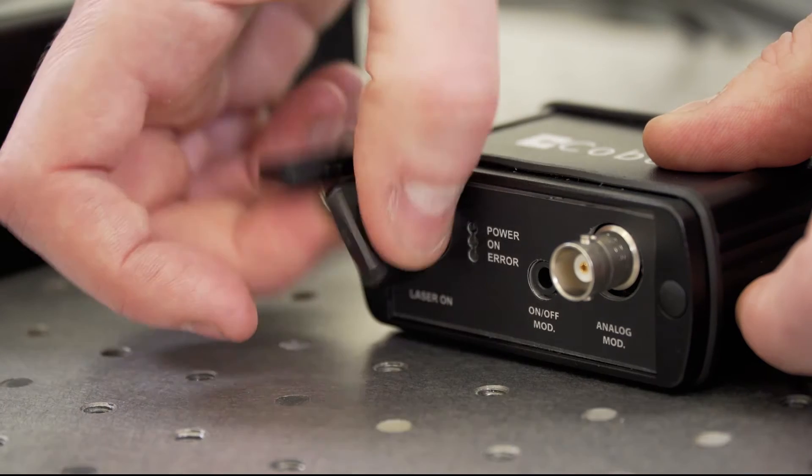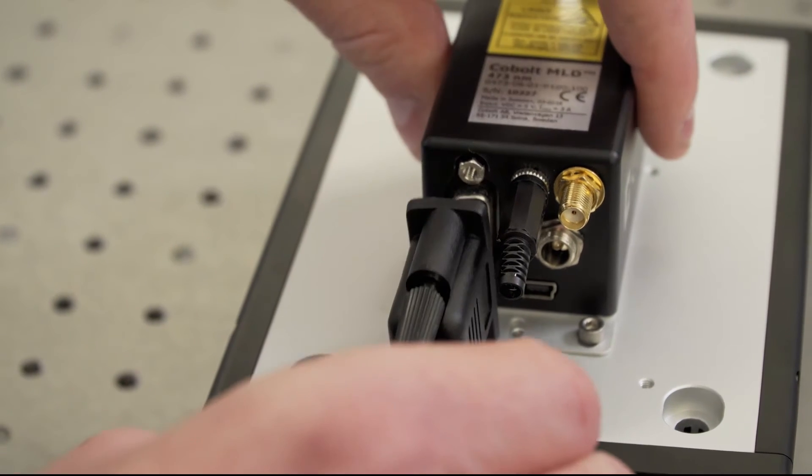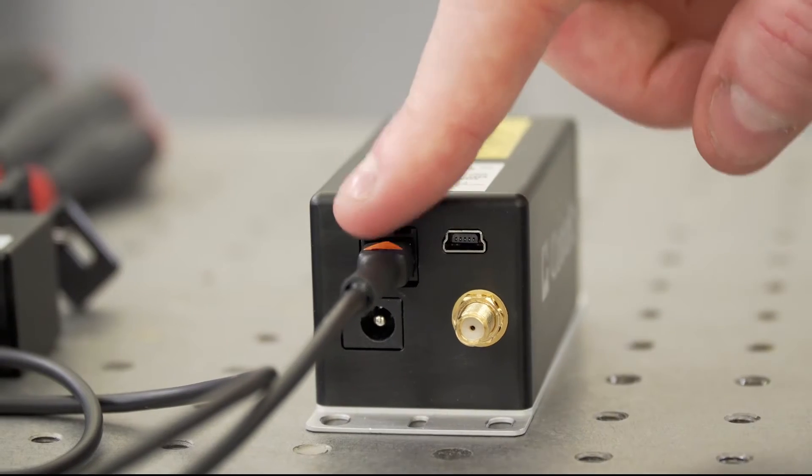If you have a CE-certified CD-RH standalone laser intended for lab use, then a key box will also be included to turn the laser head on and off. In the case of the 06-MLD, the key box is connected to the laser head with a D-sub cable, and in the 06-DPL, it's a Molex connector.